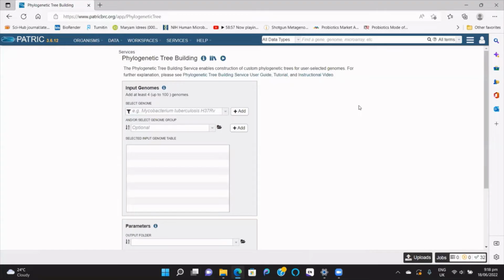So how on earth are we gonna get bacterial genomes? For that reason, I need you to click over here and search your organism of interest. Right now, I will search for Lactobacillus plantarum, subspecies plantarum. Yeah, that's a long name. So it's a probiotic bacterium. I'm going to search for it.